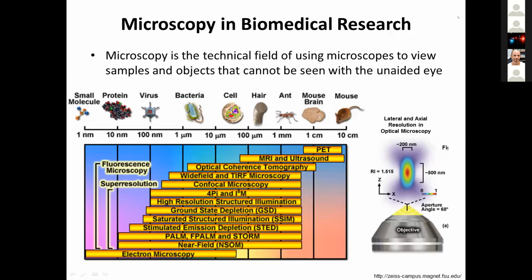So, well, as you know, the opportunity that fluorescent microscopy brings is unique because we can go from a few millimeters to tens of nanometers, covering a whole range of different techniques, from diffraction limit microscopy to super resolved microscopy. And fluorescence is really a powerful tool in order to find the particular object that we want to find within our system of study, like viruses, bacteria, cells, animals, etc.